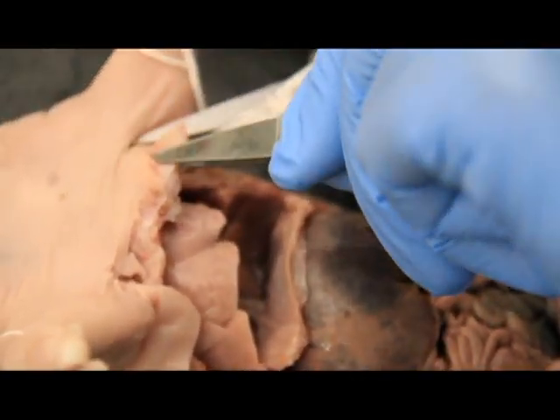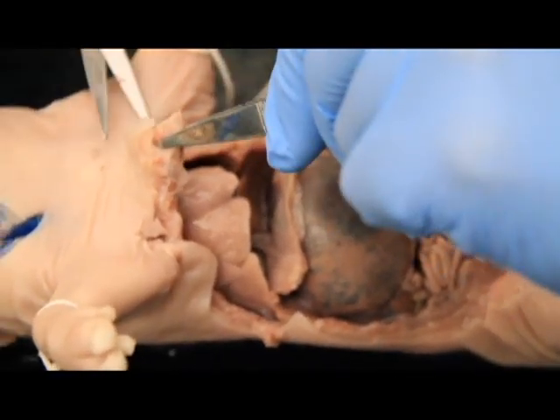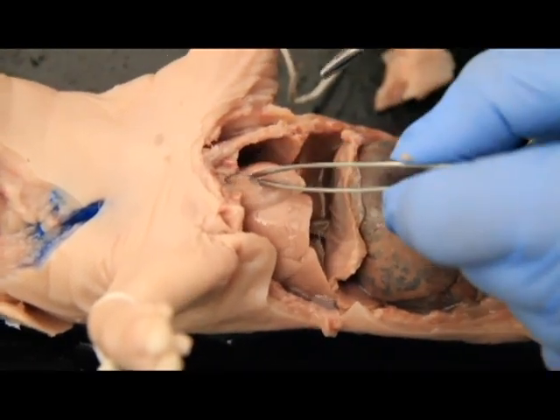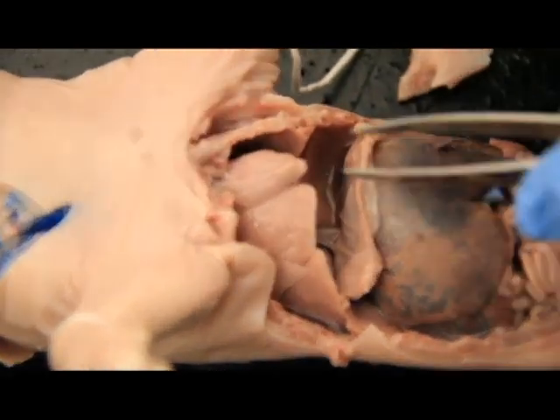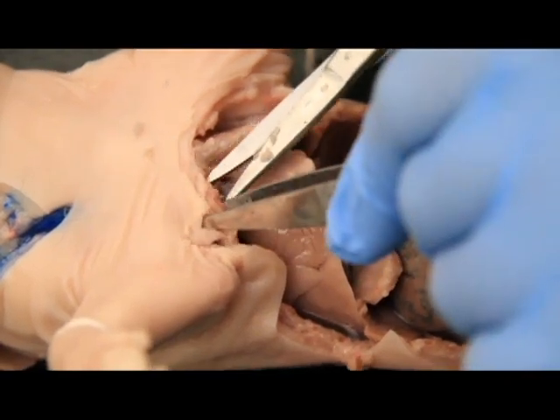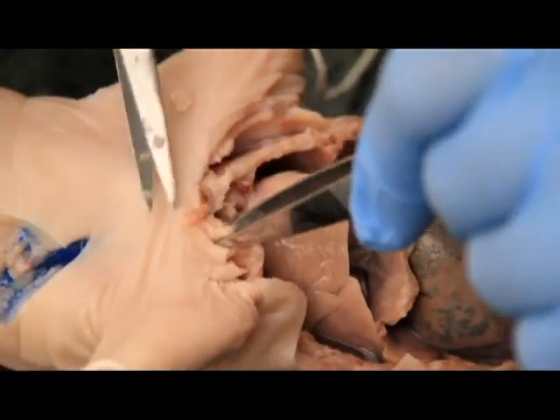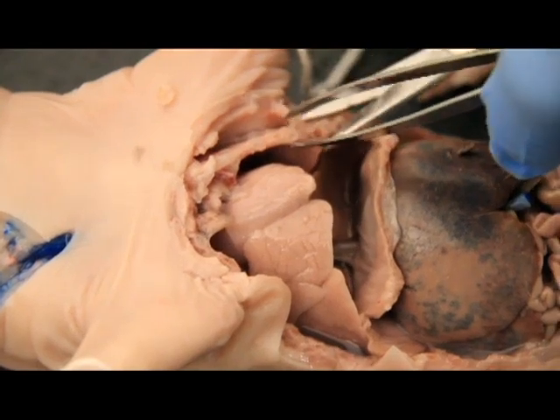Let's see if we can get in and expose our heart. Okay, so again, this is our heart right here. This membrane that's covering the heart is our pericardial membrane. Para meaning around, cardia meaning heart. This is the membrane that surrounds the heart. So we want to cut all these ribs off up here without getting too deep and exposing our circulatory system, because we're going to do all that on week 2.